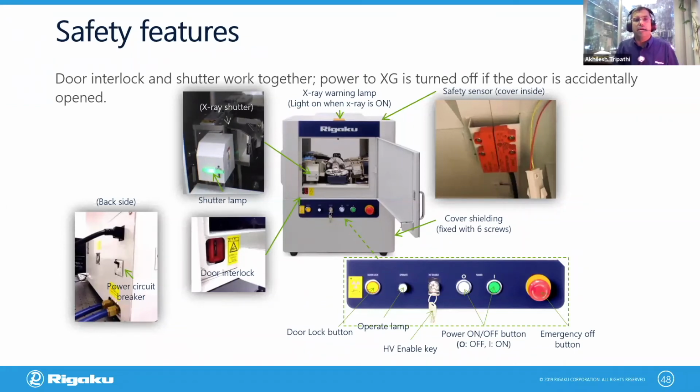There are foolproof safety features as shown in this picture, wherein these interlocks will put the shutter in the engaged position, so that you cannot have forward going X-rays when the doors are open. All the doors, as shown in this picture, also go into these door interlocks, wherein as soon as you open the door of these equipments, there cannot be any production of X-rays in the forward going direction.